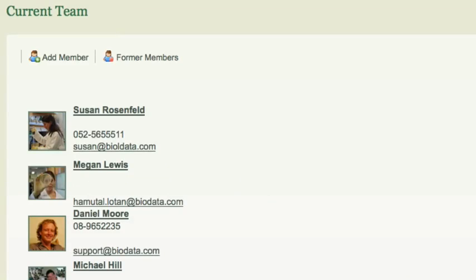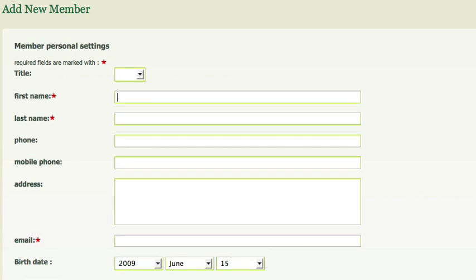Click on Members to see the current lab members. To add a new member to your lab, click on the Add Member link and fill in the form details.